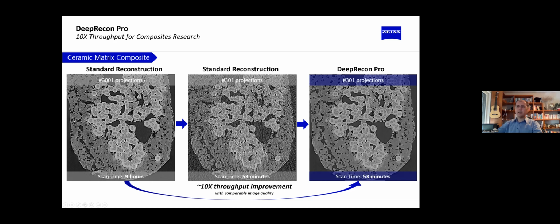So as you see here, if you are planning in situ experiments, and you have, for example, 9 or 10 stops for your in situ experiments that need 3D tomography, instead of having 10 times 9 hours, we will have one time 9 hours for the training, and then 9 times just, let's say, 1 hour. And like that, we are done with the whole experiment in a much quicker way. In this case, instead of 100 hours, 19 hours, while still keeping the quality at the original level or even better.